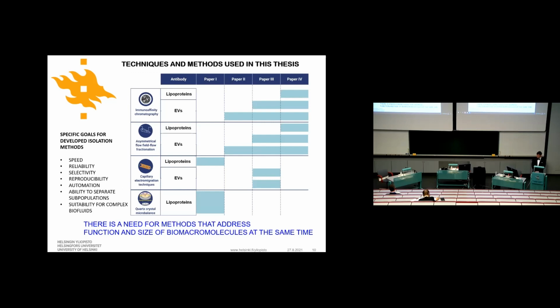We utilize different antibodies to capture lipoproteins and extracellular vesicles. And you can see in this figure how they place in different papers in this dissertation.